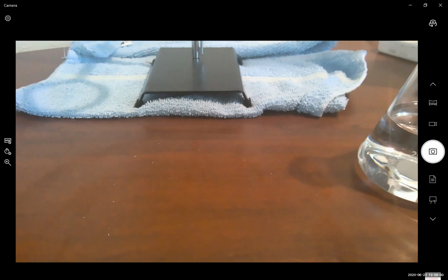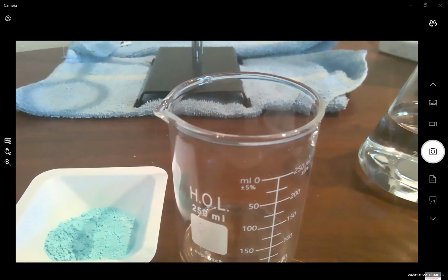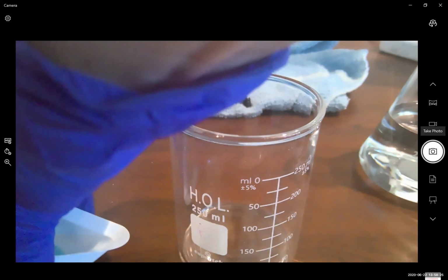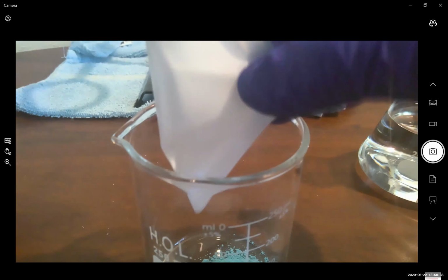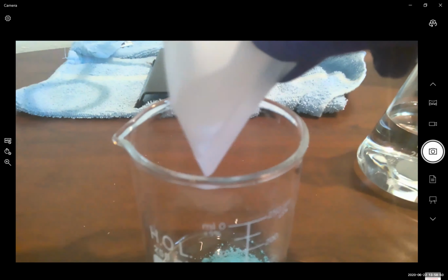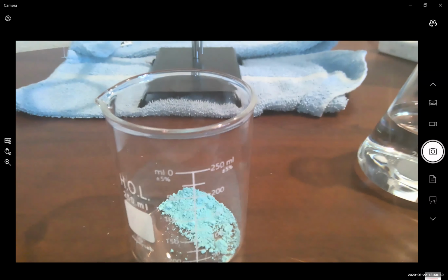Okay, so now for the next step of our experiment, we are going to pour our copper gluconate into a 250 milliliter glass beaker. The way that I like to transfer solids is to pinch both ends and then pour. If you want to get all of the solid out, you simply tap on your weigh boat. There we go. We'll leave our weigh boat off to the side, and we have our 1.4 grams of copper gluconate all ready to go.